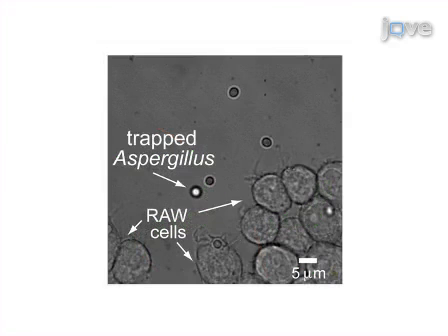As seen here, optical trapping can be an effective method for controlling two particles for observation of dynamic intercellular interactions. This method can answer important questions in host-pathogen interactions in the fields of infectious disease and immunology, including what is the effect on phagocytosis when complete control of spatial relationships between host cells and pathogens is obtained, as well as whether the order of pathogens being taken up by a phagocytic cell affects phagosomal maturation.